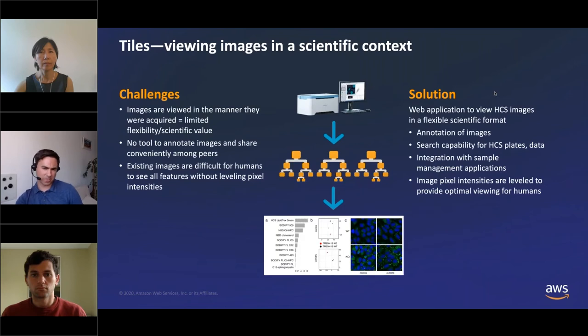So HCS tiles, and we're going to talk about this more later in the presentation, but what this tool basically does is that it enables a scientist to view images in a scientific context and view them in a way that is intuitive for somebody looking to answer a scientific question.